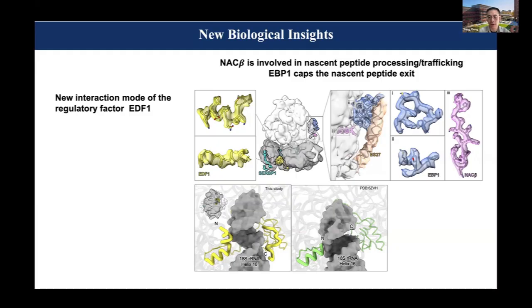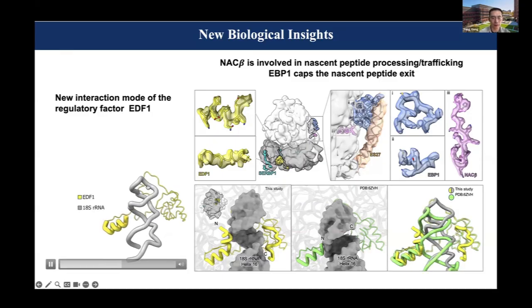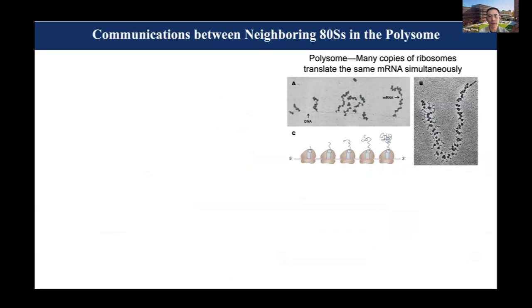If I compare the two and show an animation, you can see the difference very clearly. On the left, you see the animation from the purified sample to what we see in the cell. Basically, if you want to learn the bona fide biology, what's inside the cell is of course the most relevant state. Just an example.